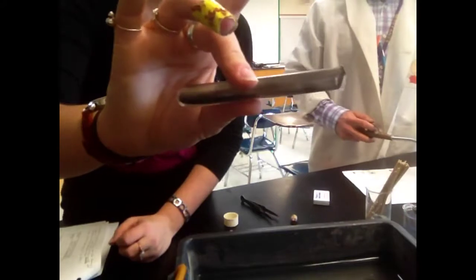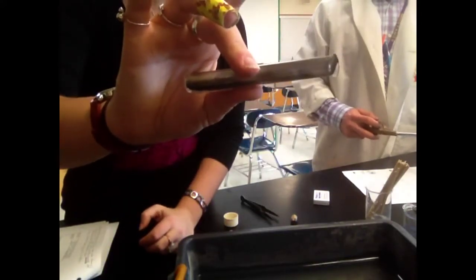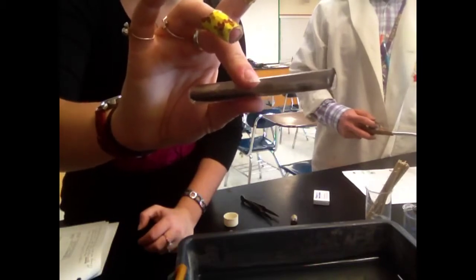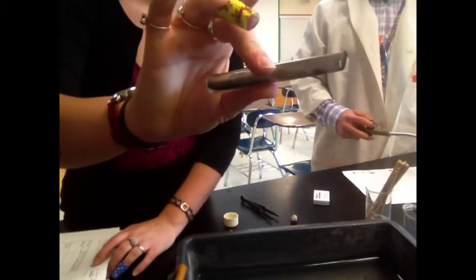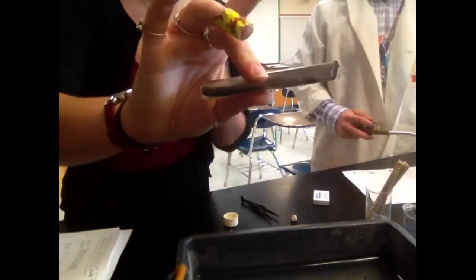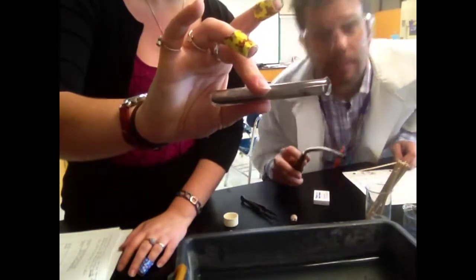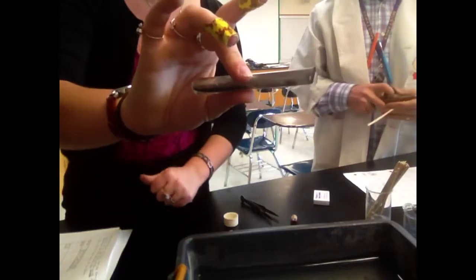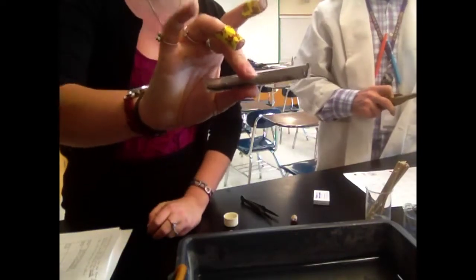And we saw in the background knowledge of our lab, it said that if we have an incomplete combustion, we end up forming carbon monoxide and carbon, which is the same observation as the soot. So you could think about if we see soot, whether it's going to be an incomplete or complete combustion. And so this is your half-full acetylene gas test tube. So you want to write your observations down in your data table for this one.